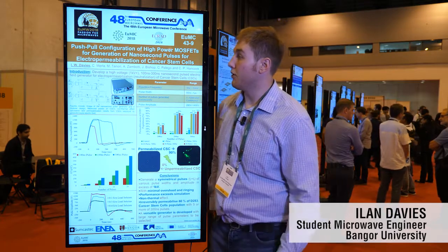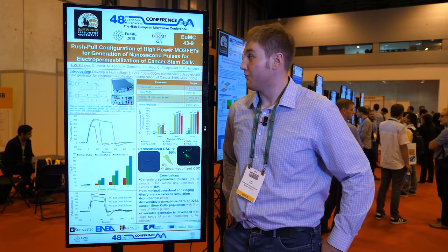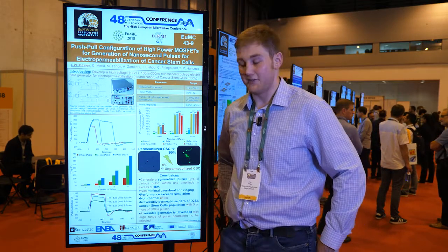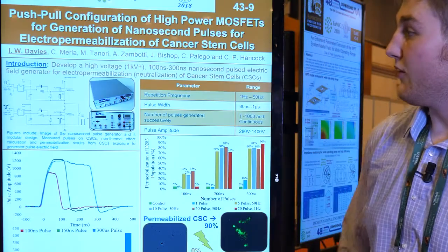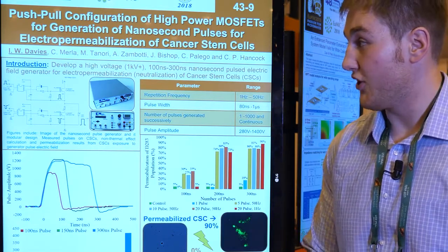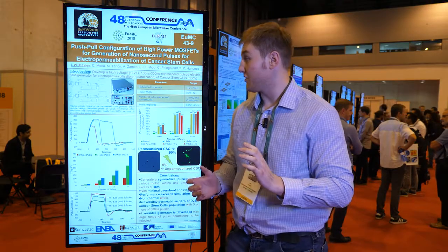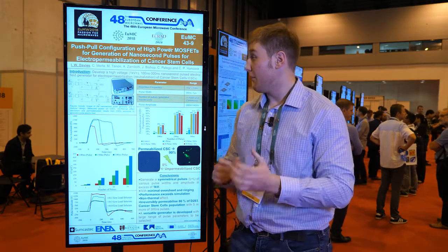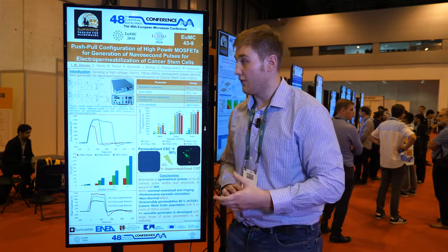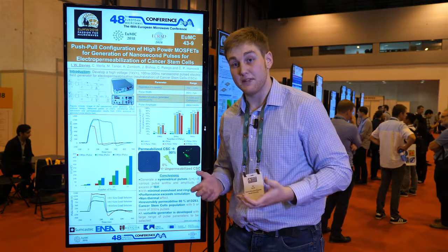Hi, my name is Ilan and I'm presenting this poster today, a push-pull configuration of high-power MOSFETs for generation of nanosecond pulses for electroporation of cancer stem cells. So here what we've done is we've developed a nanosecond pulser which generates a high voltage of 1 kilovolt and pulses of 100 nanoseconds to 300 nanoseconds pulse widths. And all of this is to see the effect they have on cancer stem cells.